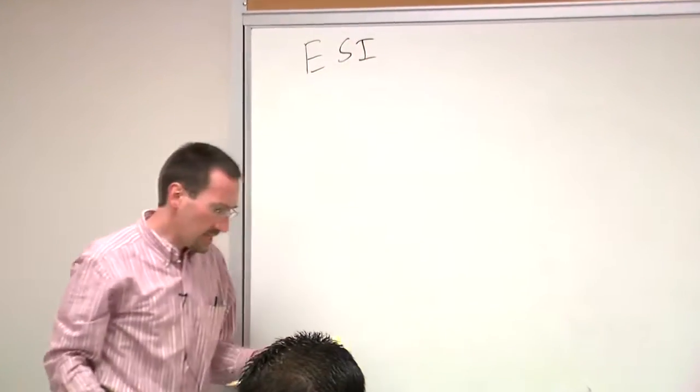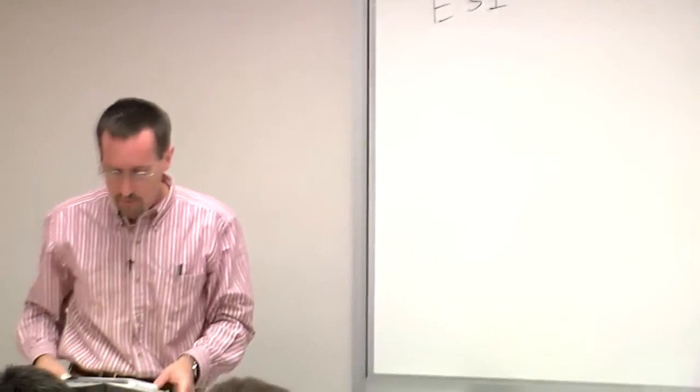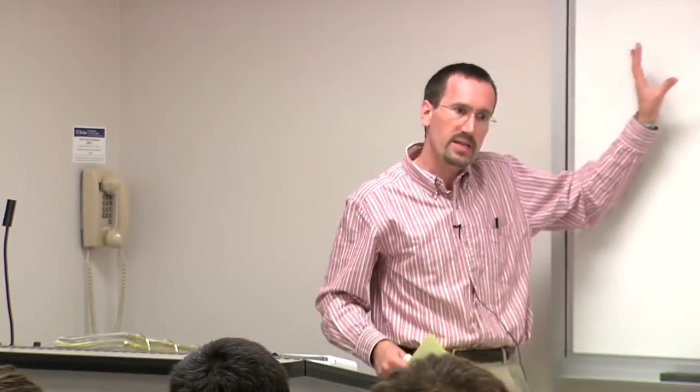ESI is another technique that's widely used now. These are our open access instruments. Mass spec has become very populist, very cheap, very easy to do. One of the reasons is that a regular EI mass spectrometer is a relatively fussy instrument, although they're often made into parts of gas chromatographs and so forth, they often require a lot of care.